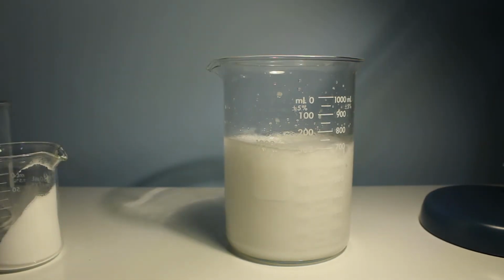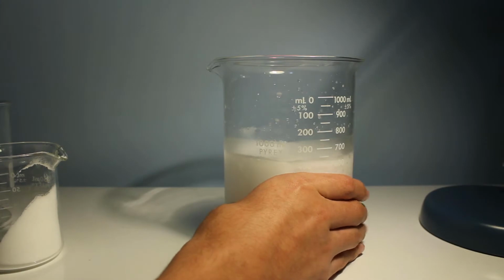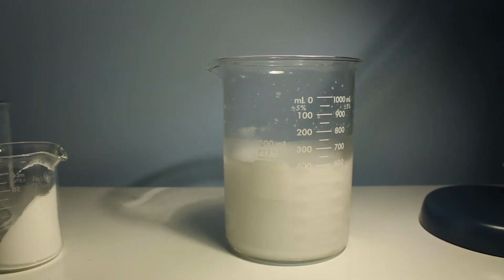Now, something to keep in mind is that this reaction is endothermic, meaning that instead of releasing heat, it takes heat out of things, like cold packs. And so this reaction vessel is becoming very cold. Almost like ice.